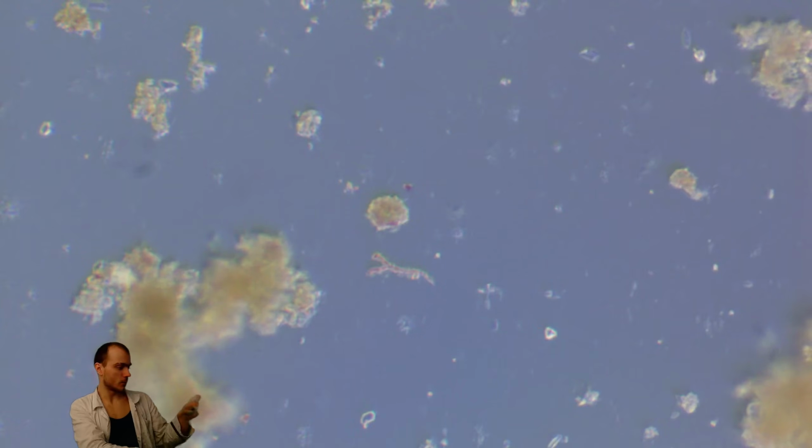This one looks a little bit like mycelium. This branchy structure. But mycelium more commonly does not have this cleanly seen shape of each individual cell.